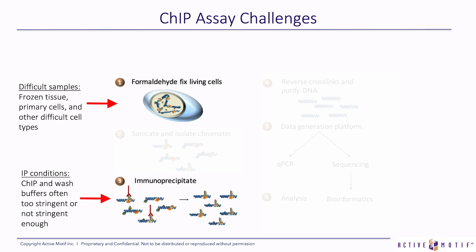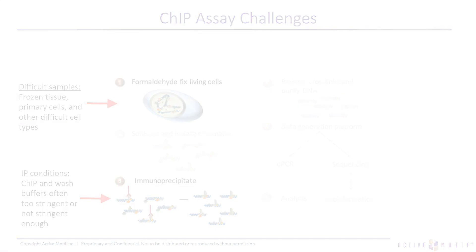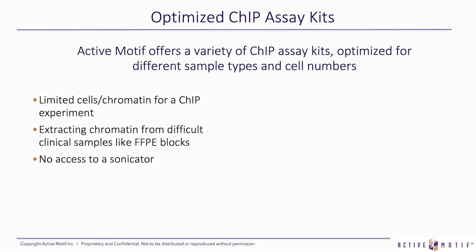Also, the IP conditions. A lot of times the ChIP buffer or the wash buffer is either too stringent or non-stringent enough. This can result in a lot of background or just not getting any DNA from your ChIP reaction. We have ChIP-validated antibodies to address those problems. We have ChIP kits with optimized buffer systems and wash buffers to solve the problems of not having enough stringency with your immunoprecipitation or your washes.